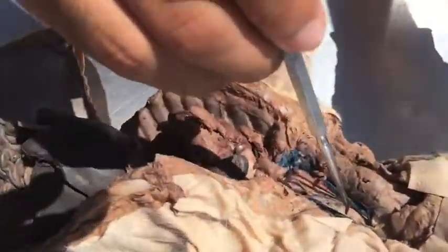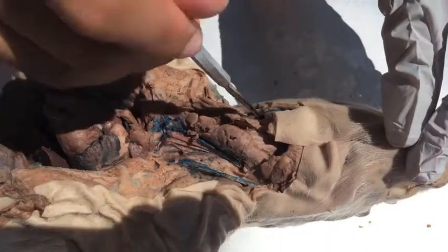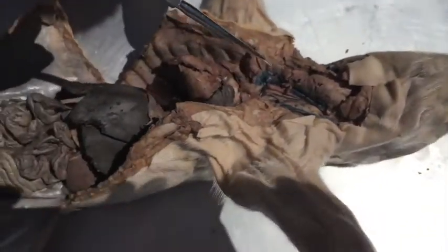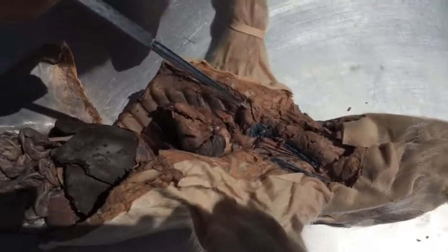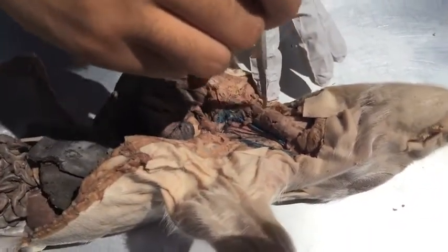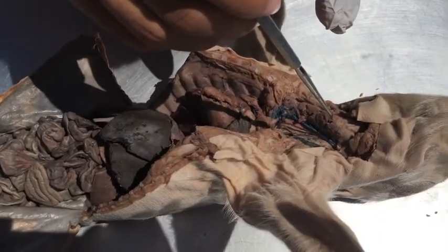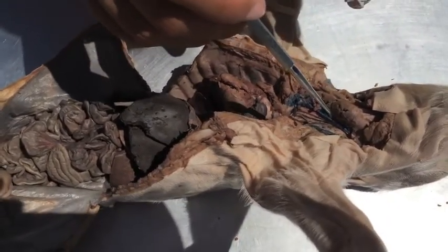And the external jugular veins are right here, and the other one on the other side is right here. And it carries blood from the outside parts of the head and neck to the heart. And then the internal jugular vein is right here. And there should be another one on the other side over here. And it is the blood vessel that drains portions of blood from the face and the cerebral veins.